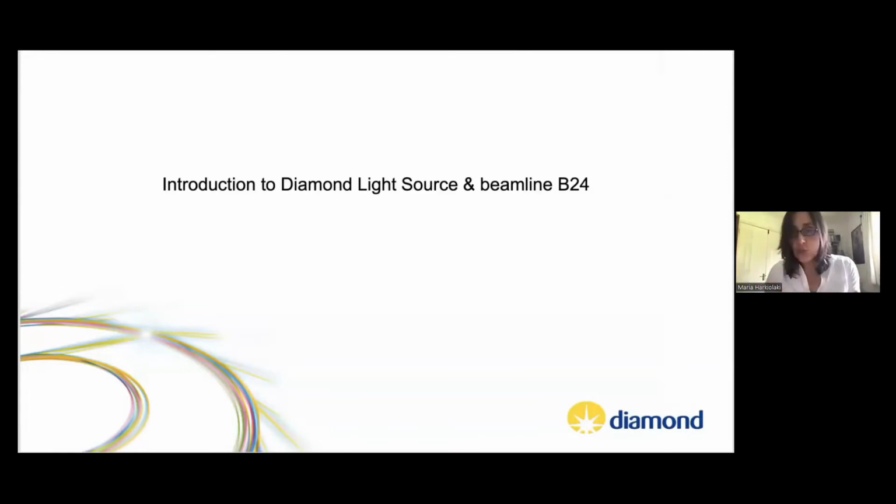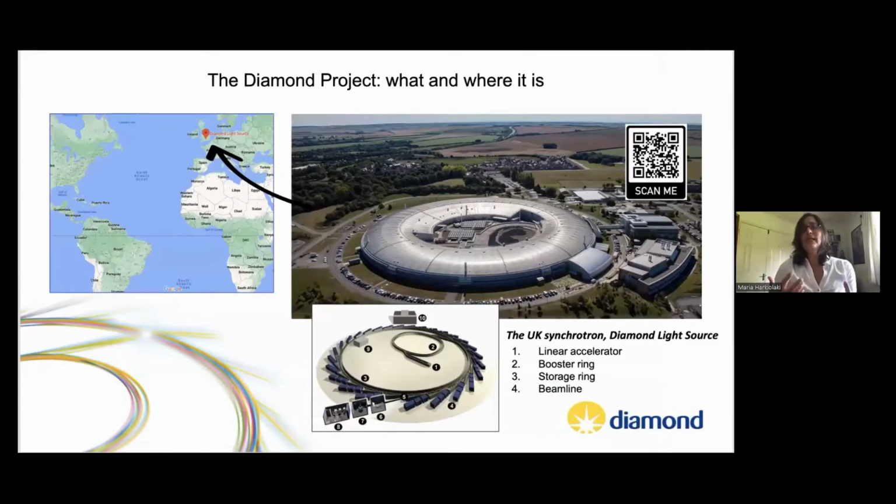I'm never quite sure when I talk to new people if they're familiar with synchrotrons. So this is the titular slide on synchrotrons. We're up here, very, very far away from you. I wanted to make this point because although we're that far away, we have users and collaborators from across the world. If anything, the lockdown and COVID brought about a new age of remote access. And the synchrotron in the UK is supremely accessible to anybody, especially academics from around the world.